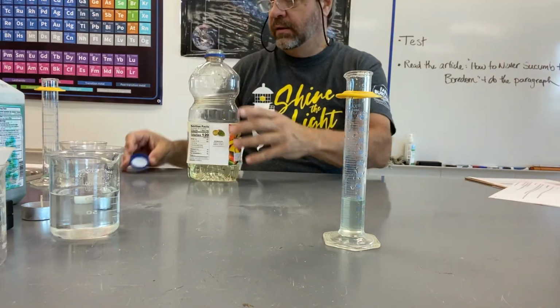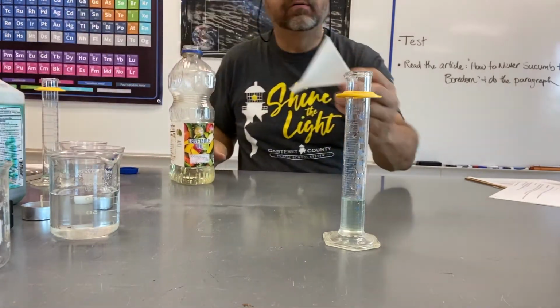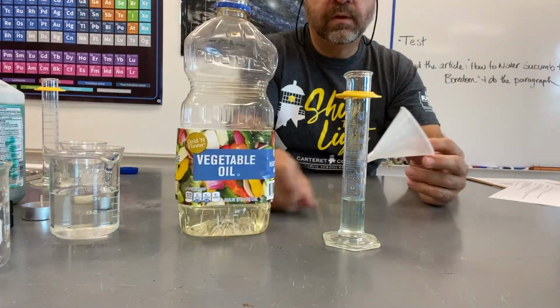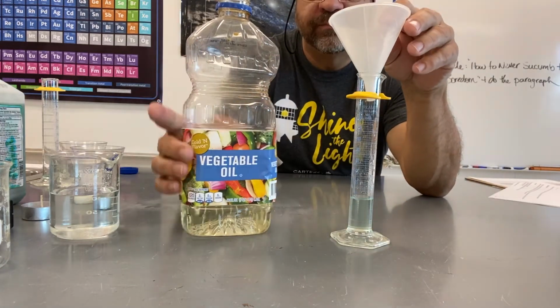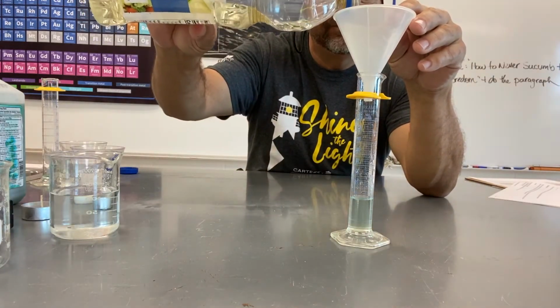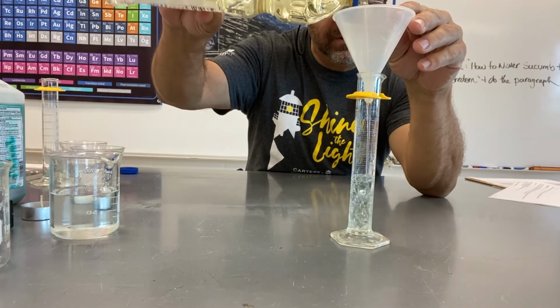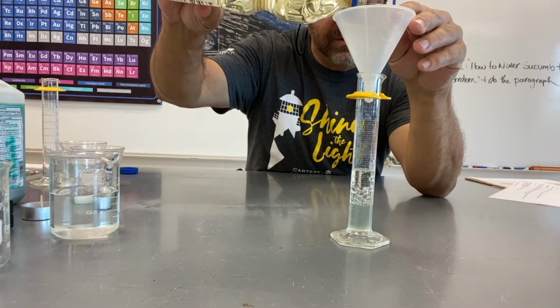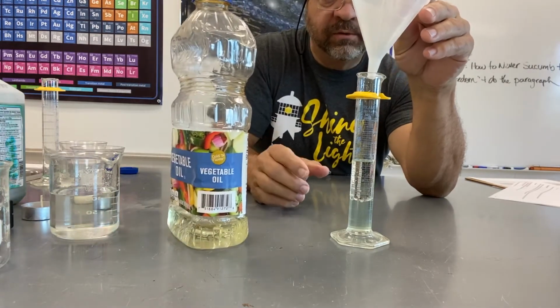Next, I'm going to add about 15 milliliters of vegetable oil. Again, turn it so I can see the scale. And 15 and 15 is 30, so I'm going to go up to 30. Well, maybe I'm going to go up to 32.